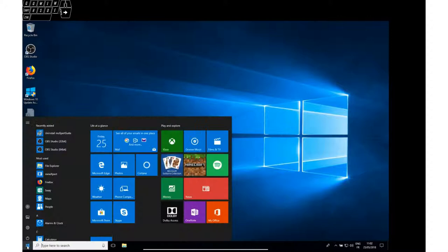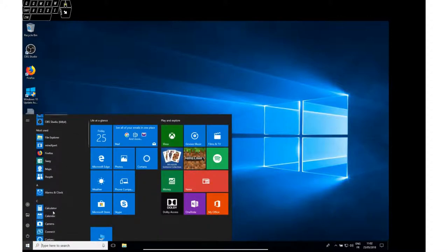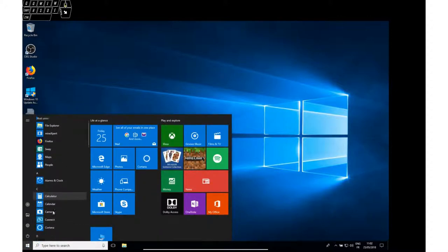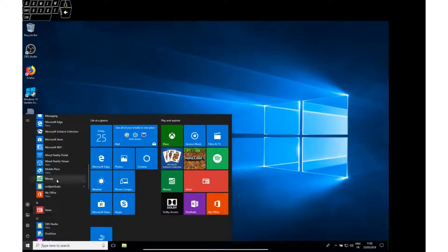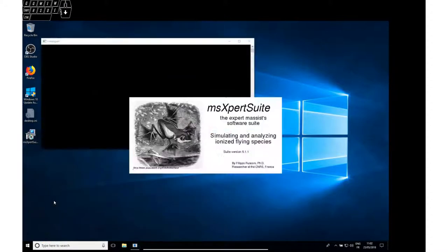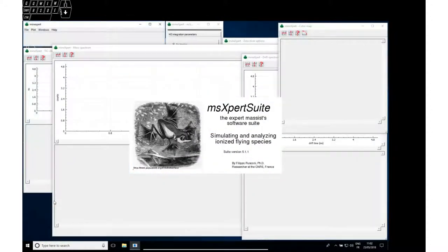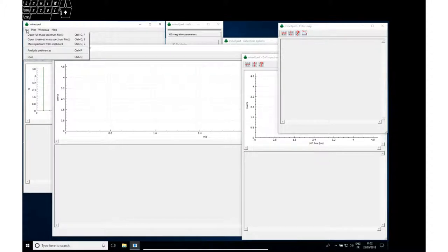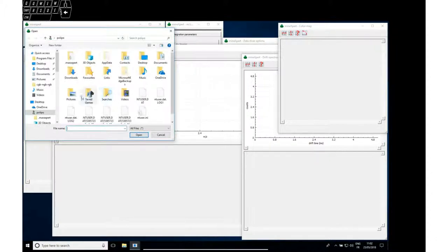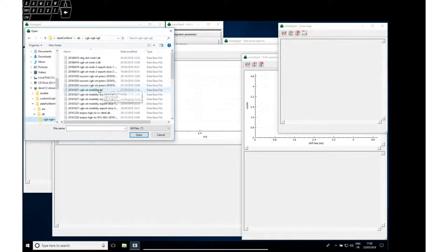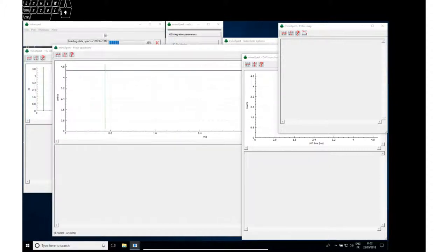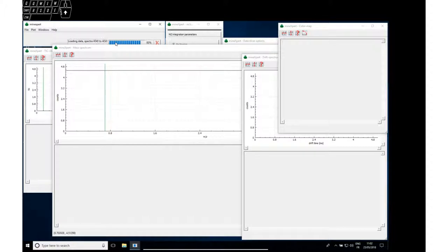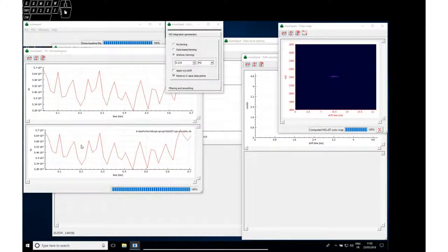Now test Mine Expert very quickly. Where are we here? Mass Expert Suite, Mine Expert. Apparently it works. Quickly open a file. It is loading the data, computing the TIC chromatogram.